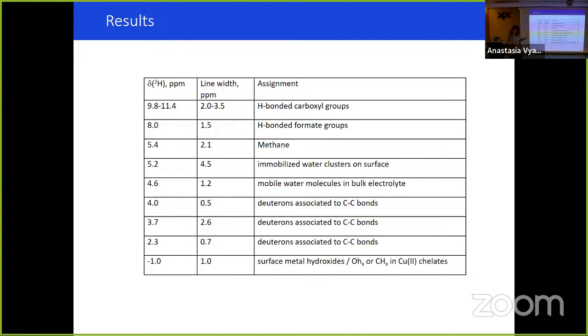This study is not that, of course, and this is just a proof of concept that we can observe. And this was the aim of this study, to fabricate such a cell in order to find proper chemical and electrical conditions for effective and selective electroreduction. So we want to see that it works, and now we can use it to vary electrical conditions, to change electrolyte, to change concentration, and find where it works the best. This is only the beginning of our work.